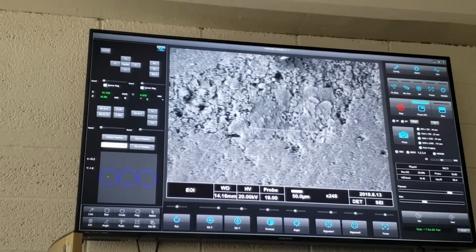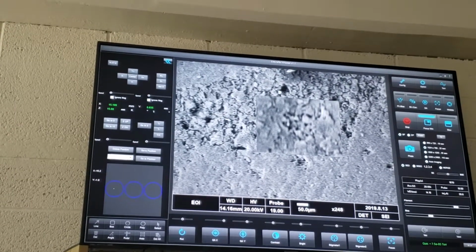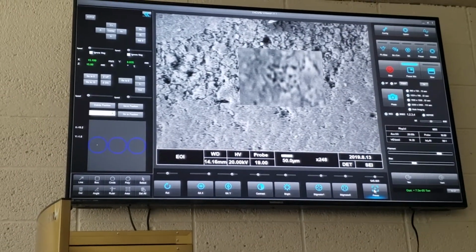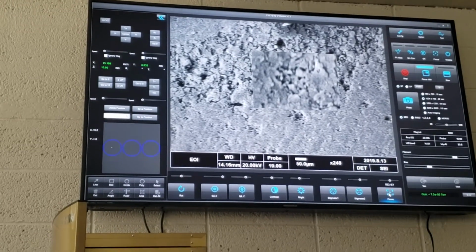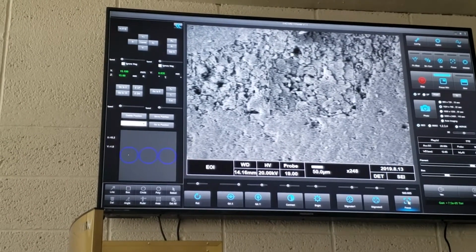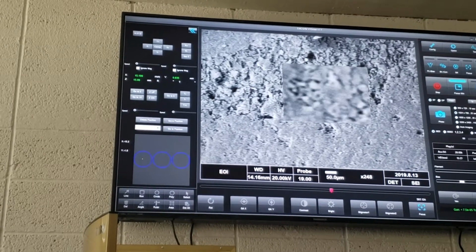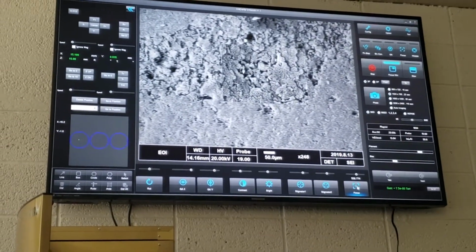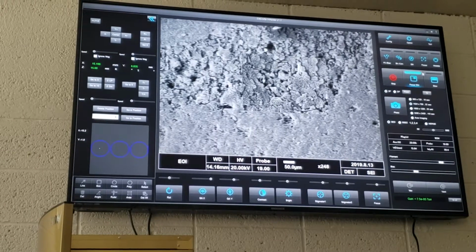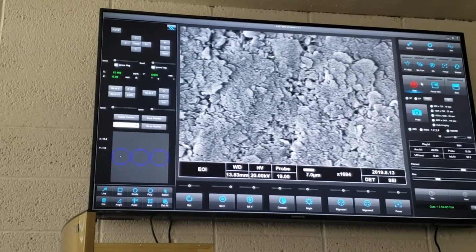And just like the contrast and the brightness, and just like rolling up with magnification, if I decide to go to focus this, right? Meaning if I use my focus feature right here, if I start rolling the trackball on the mouse, I keep rolling the trackball on the mouse and I start focusing, right? Or I could have left click and my focus would have been a lot more coarse, like you're moving a coarse focus knob. Right? And then at any point in time, I could come back out of my focus window, and then the whole image would turn to what exact mag that was, which is just very low mag right now. And so that's just focus window.